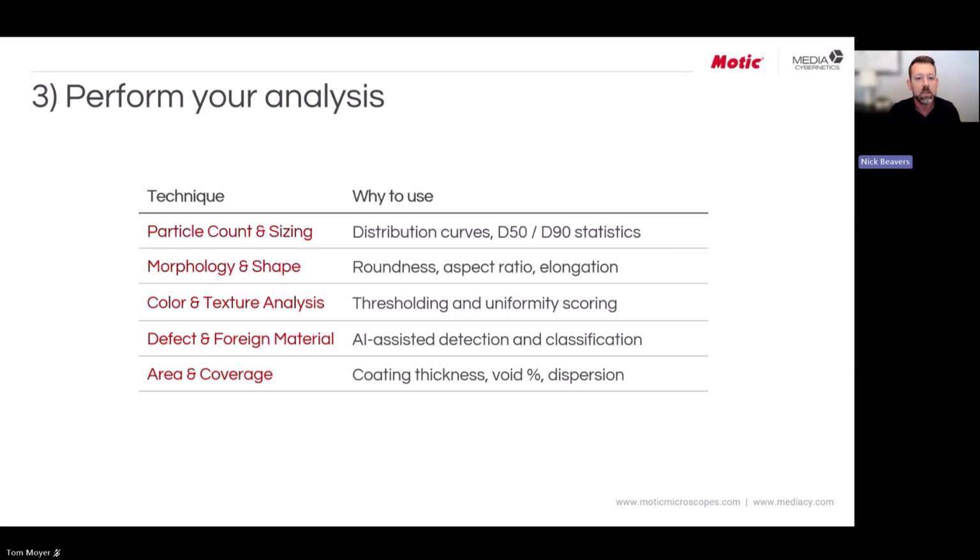I've captured my images. And of course, the last thing, kind of teeing up Tom to give you this great demo: if I open up Image Pro, I need to be able to capture certain types of measurements. What we're going to offer you today is a variety of ways of capturing literally thousands of measurements. Obviously, you probably don't need thousands of measurements, and that's why we produce these protocols that allow you to do a very simple particle count and sizing, and it does just that.